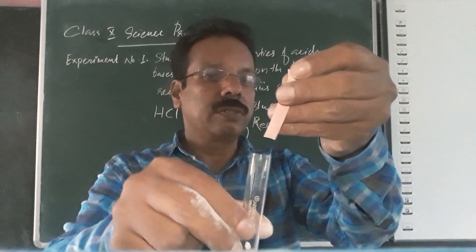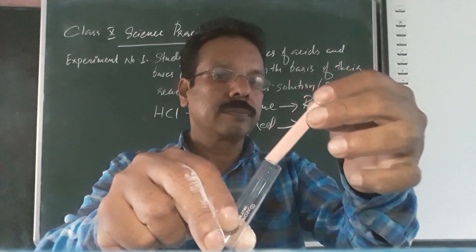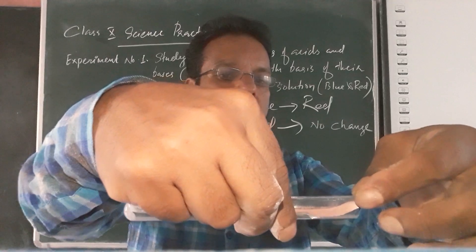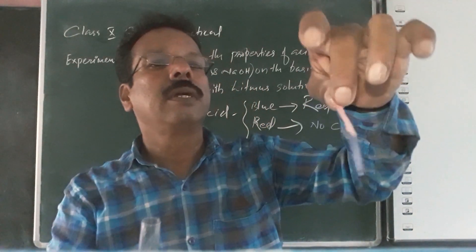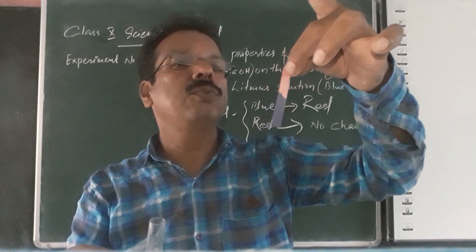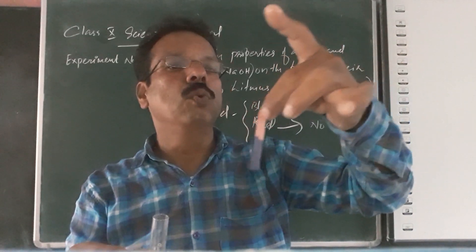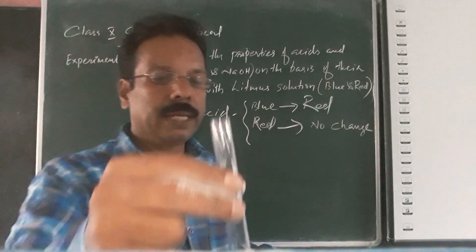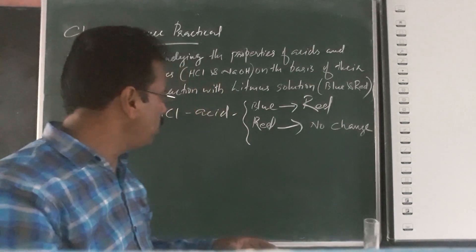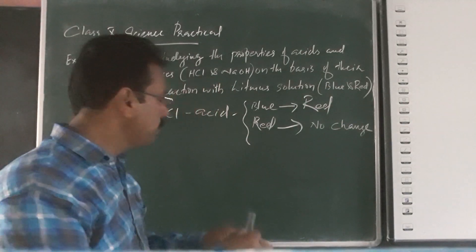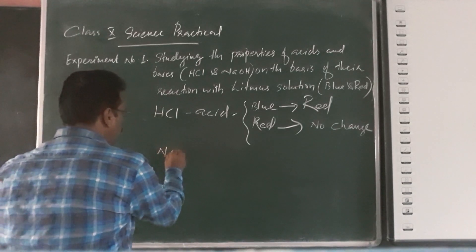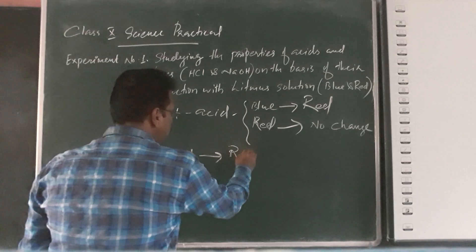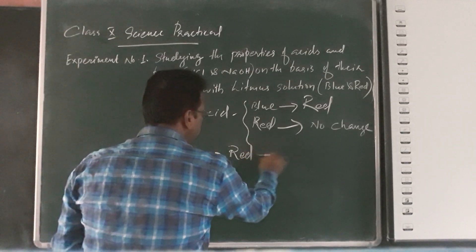We have to check it with the red litmus. Any color change? The color changes to blue. So in a basic solution — NaOH, sodium hydroxide — red litmus changes to blue.